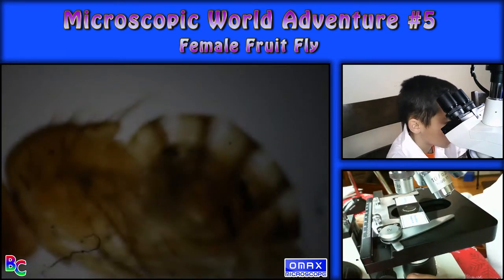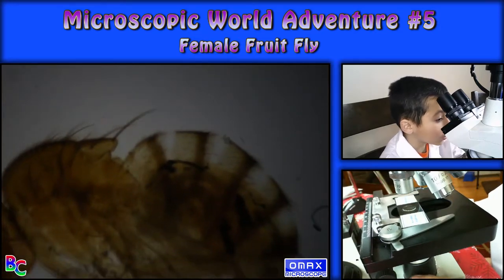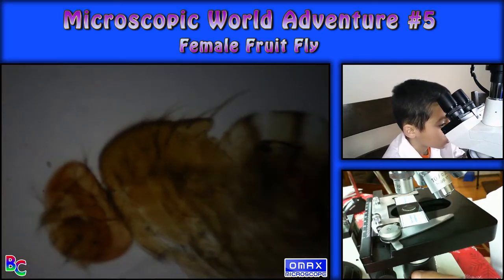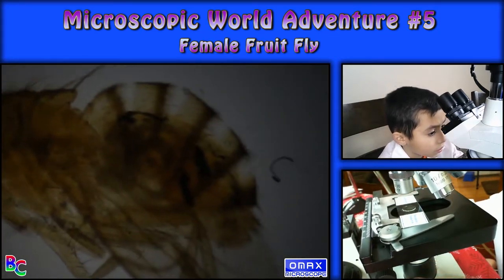Focus it. I don't know what that is — it looks like a snail. And it also looks like a bee. There's a bee.